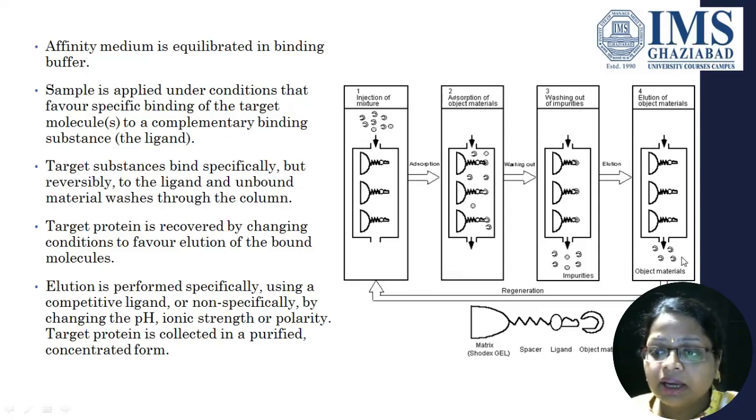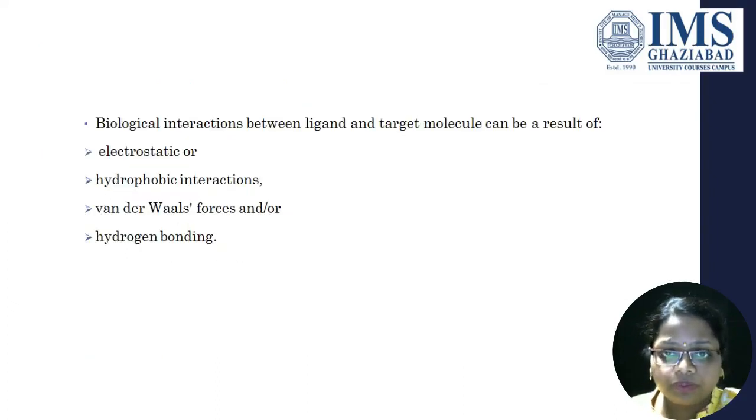And this is done by either changing the buffer conditions, the pH, or competitive binding. That we'll be discussing in detail at a later stage.